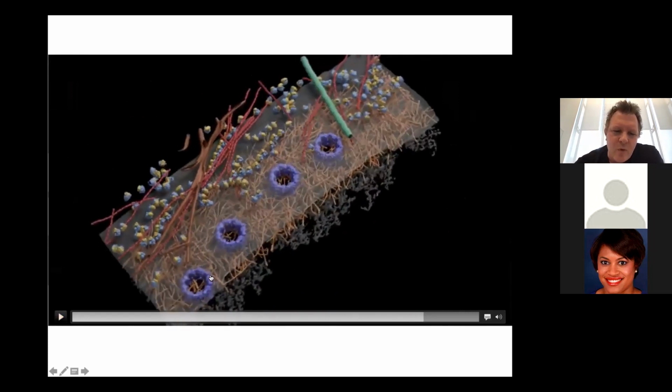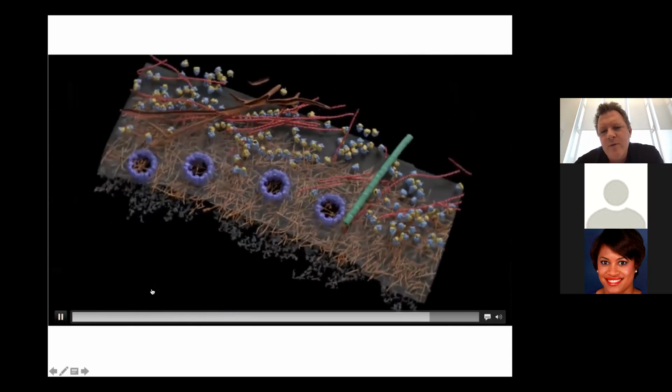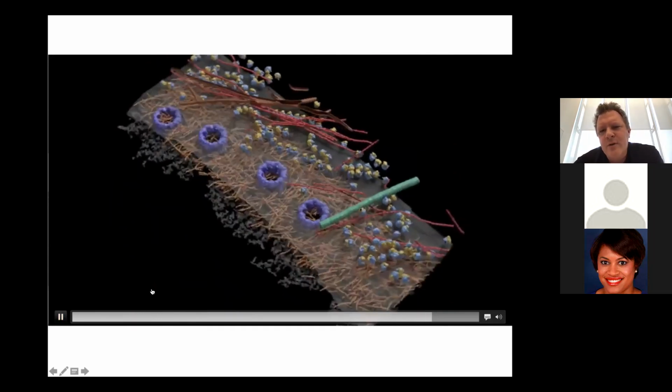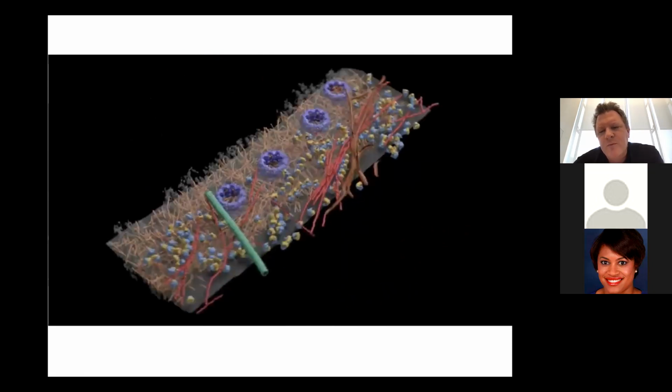You can see the nuclear pore complex here. You can see actin, you can see microtubules, you can see ribosomes clearly resolved. And so this is really kind of where the field is going and where we hope to be able to make major inroads here at Columbia using these core instruments.